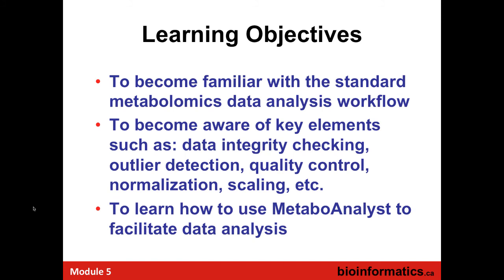We're going to talk about some of the things involved with data integrity checking, detecting outliers, some QC or quality control, normalization, transformation, scaling, centering, and then the multivariate statistics. And we'll use several examples just to show you how the data analysis can be done.